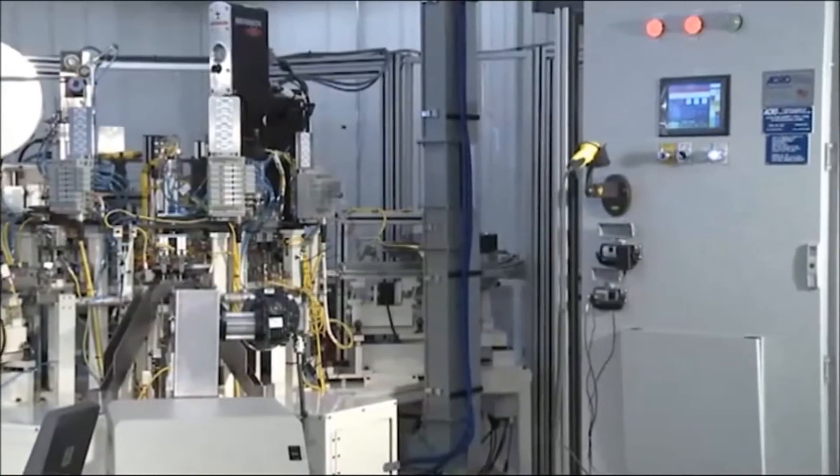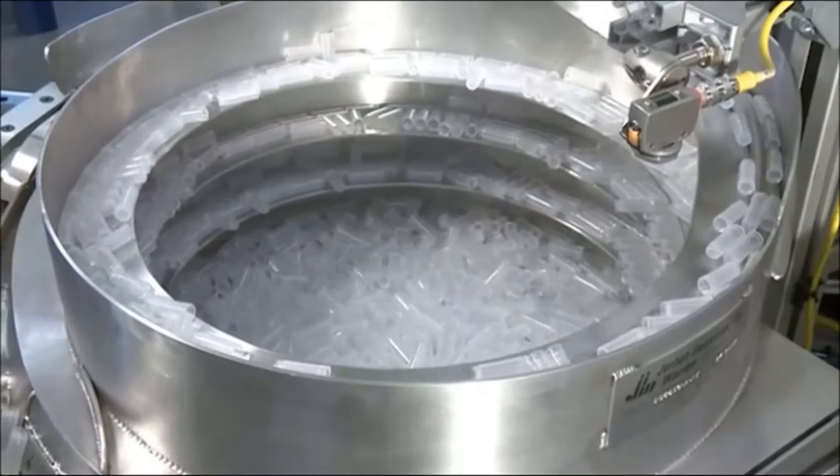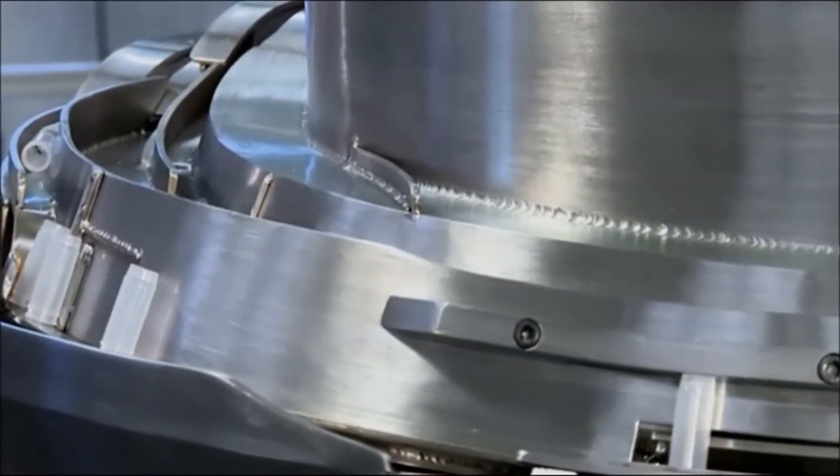This machine assembles a syringeless filter consisting of two chambers. One of the chambers holds the raw liquid with particles, and the second chamber, called the plunger, contains the filtered fluid without particles.